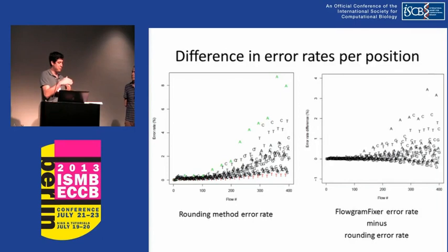Because a lot of noise means you're putting more weight on the probabilistic part and less weight on the combinatorial part. And these are the places where the combinatorial part would give you a lot of information. So if your noise estimate is too high, you're going to underdo these and overdo the difficult problems where the combinatorial part is less important and all of the information is in the probabilistic part. So we believe that adapting the noise to different rows differently would solve this.